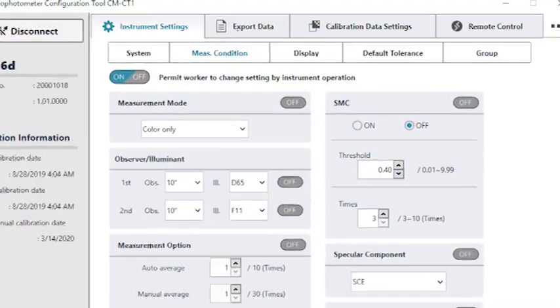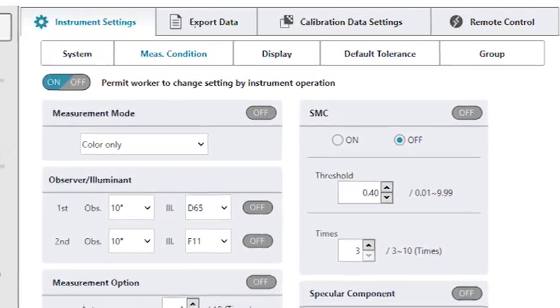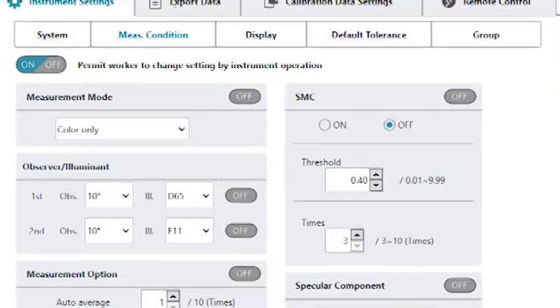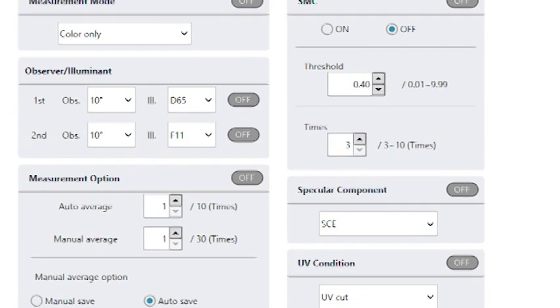The CMCT1 configuration tool software, available as a free download, allows users to create and write instrument settings, as well as compile them into a file and share it within the supply chain to ensure consistent instrument settings.